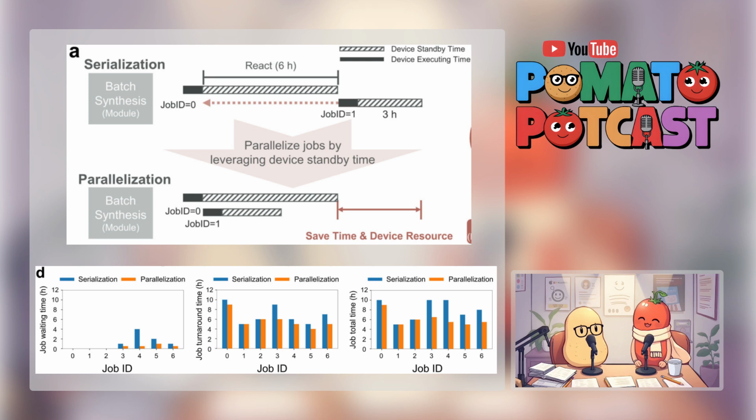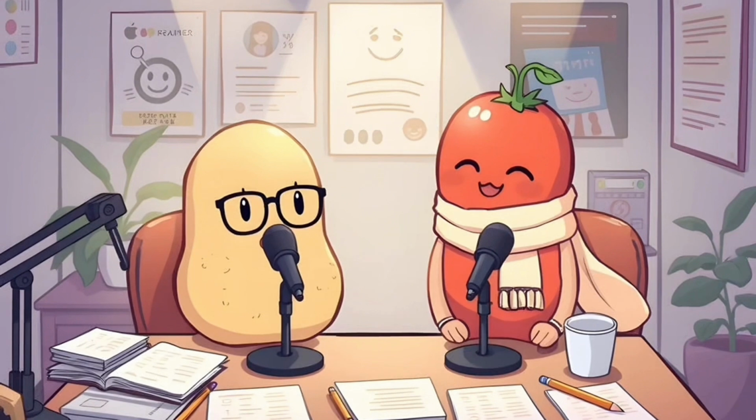But what about all those limited resources you always hear about in labs? Expensive equipment, limited space. How does OCTOPUS deal with those constraints? So we've got all these robots working in modules, but lab space is always limited. How does OCTOPUS deal with that? It's a bit like a game of Tetris, actually. OCTOPUS uses this closed packing schedule algorithm to maximize space.